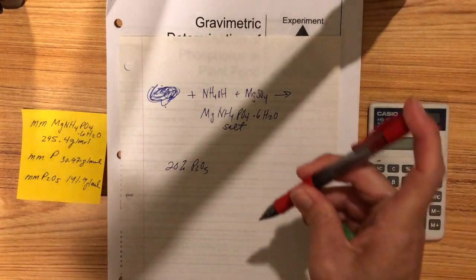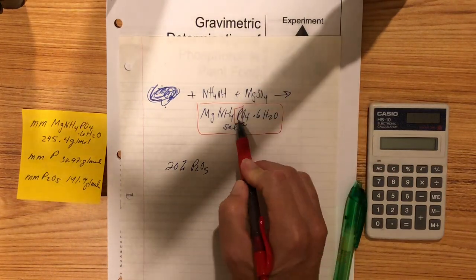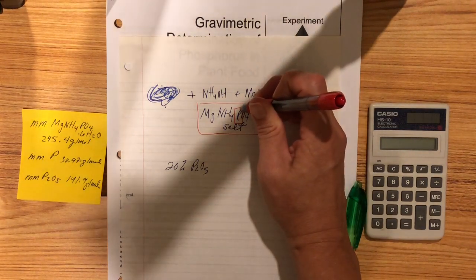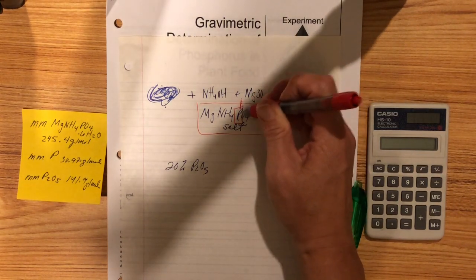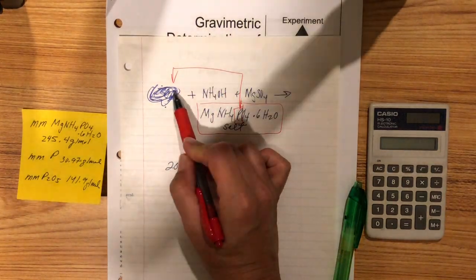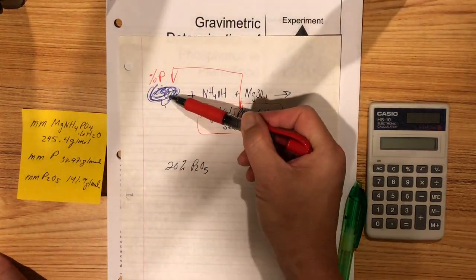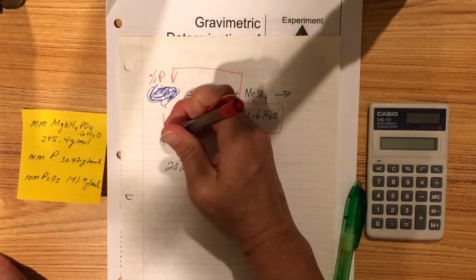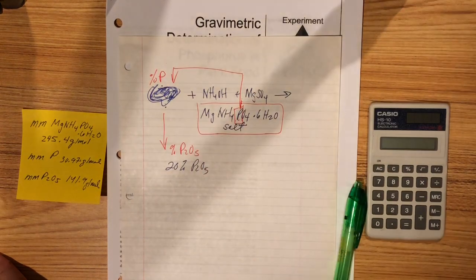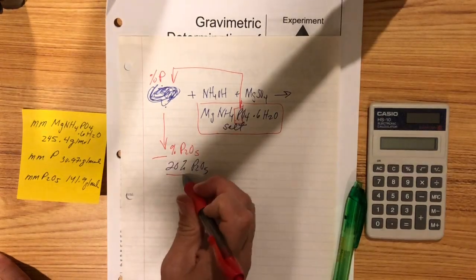So since we isolated this solid, we can figure out how much phosphorus is in the solid. Using the stoichiometry, we can extrapolate back. If this is how much phosphorus is in the solid, then that's how much phosphorus must have been in the fertilizer. And so then we can figure out the percent phosphorus in the fertilizer. And once we get the percent phosphorus in the fertilizer, we can get the percent P2O5 that it came from. And that's when we're going to compare these to our answer and the box answer.